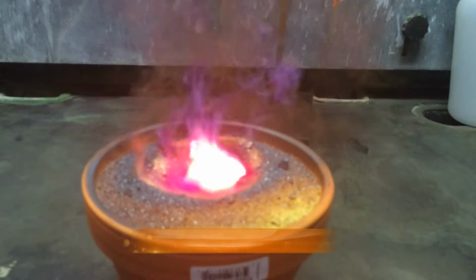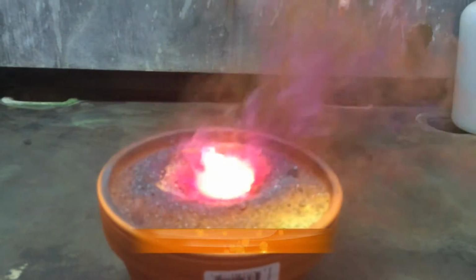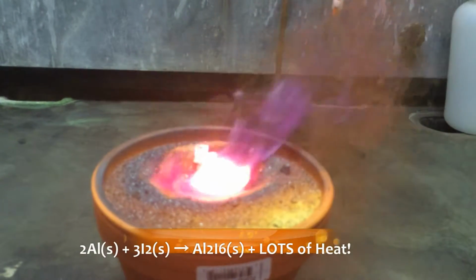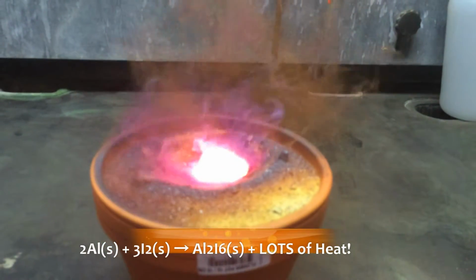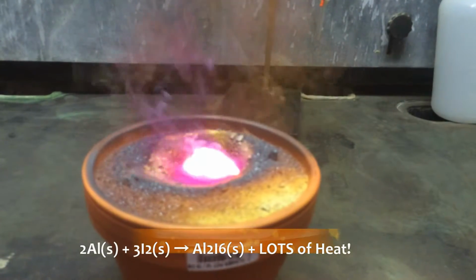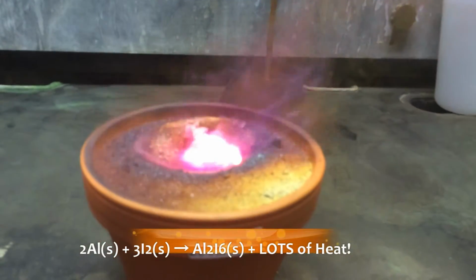Now you may be wondering why in the equation I didn't show any gaseous iodine being produced. It's actually a byproduct because the aluminum is actually burning, so it's not a complete reaction. So the iodine that's lost as a gas is correlated to the amount of aluminum that's burning, which you can actually do some pretty neat stoichiometry equations with.